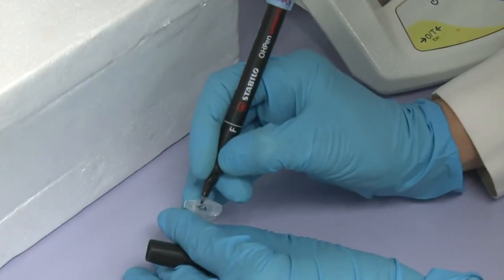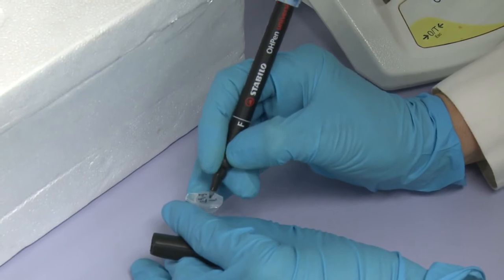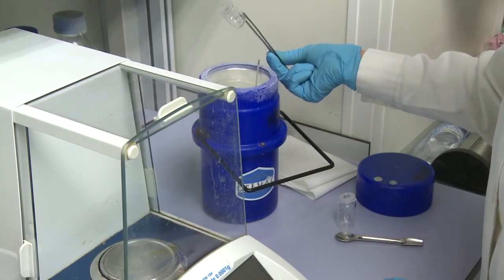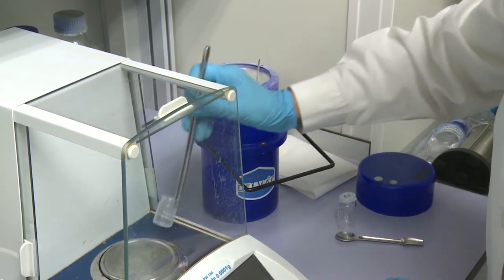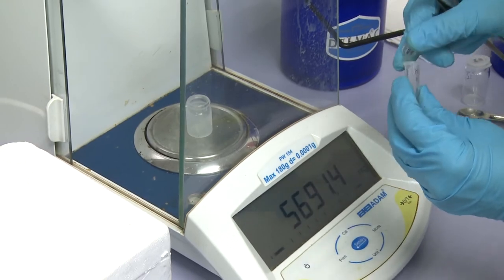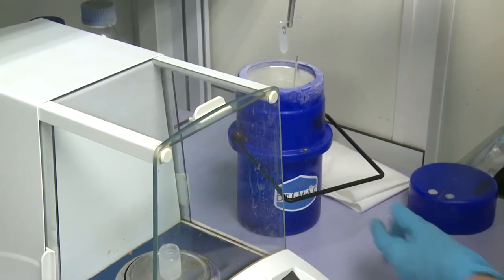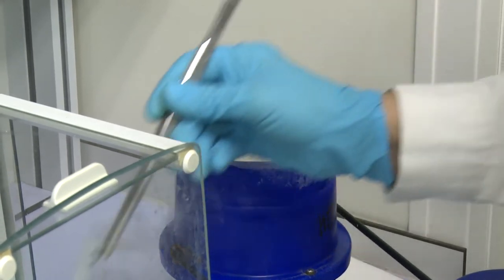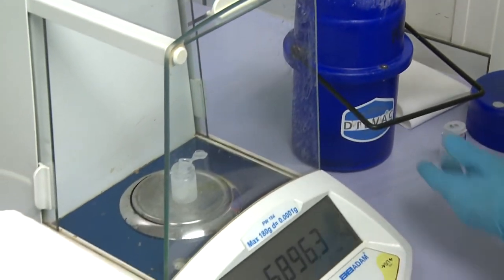First, cool with liquid nitrogen both the 2 mL Eppendorf tube where the sample will be weighed and the spatulas that are needed to do so. Then, weigh 0.5 g of frozen leaf powder in the Eppendorf tube under liquid nitrogen conditions.